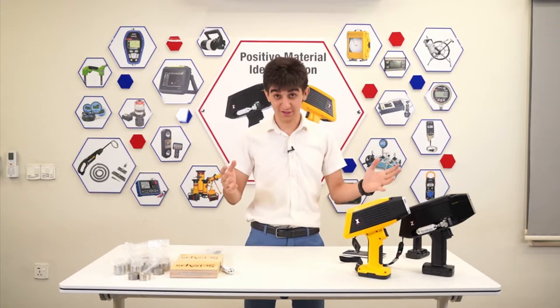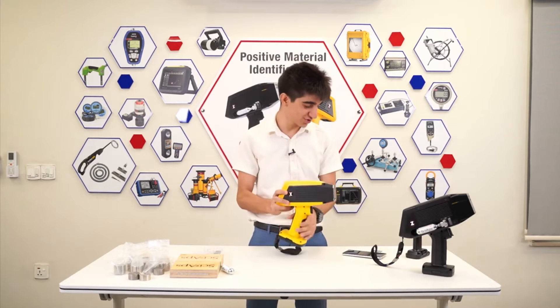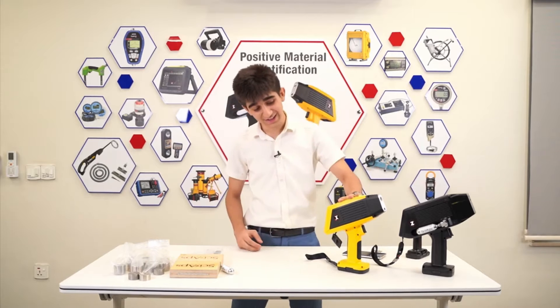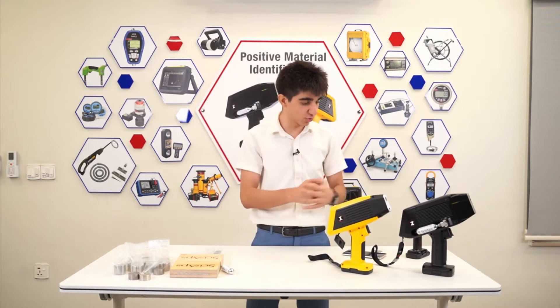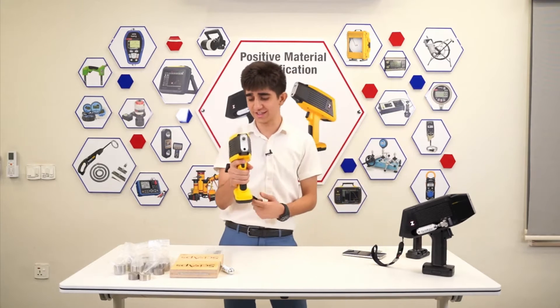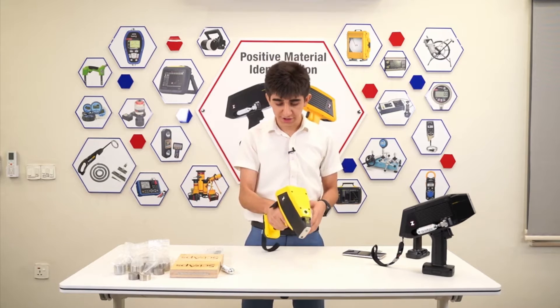These units are handheld, pretty lightweight to use. They are from SIAPS — the Z902 and the X200. Let's do a couple of demonstrations for both of the units. This one here is the XRF technology — as you can see, super lightweight.